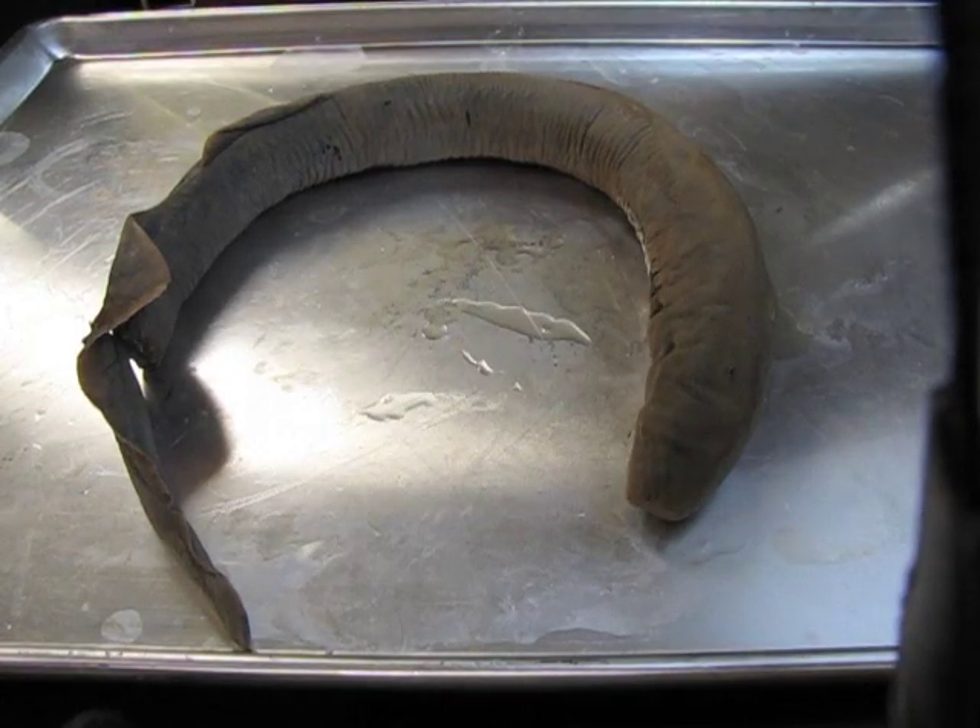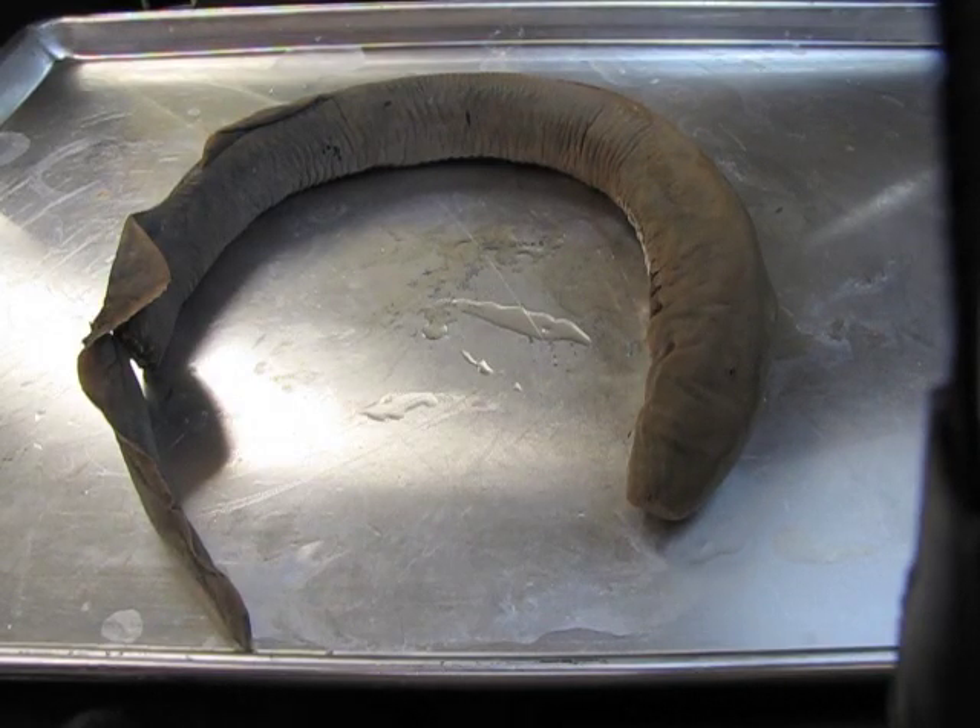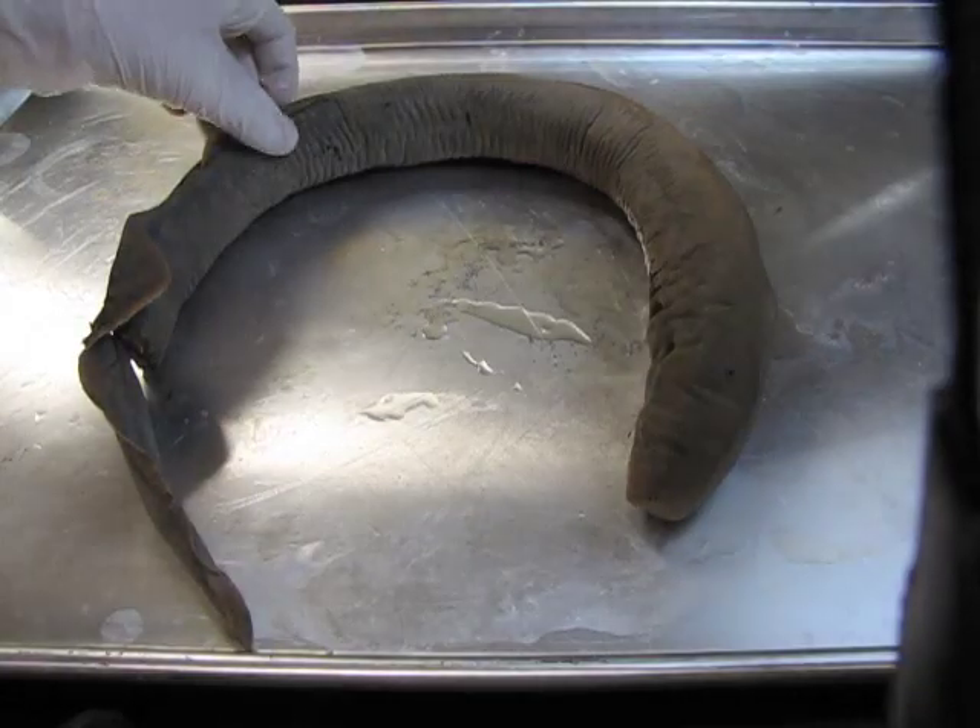This strange-looking animal is a lamprey. Lampreys are in the phylum Chordata, the subphylum Vertebrata, and in the class Petromyzontida. We're going to start by looking at the external anatomy of this animal.